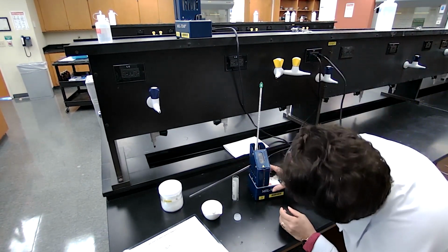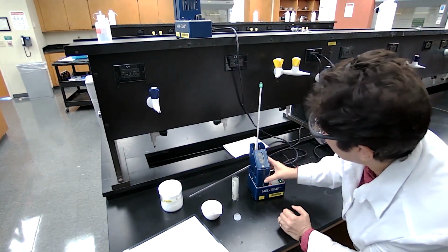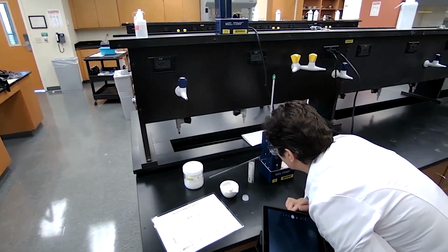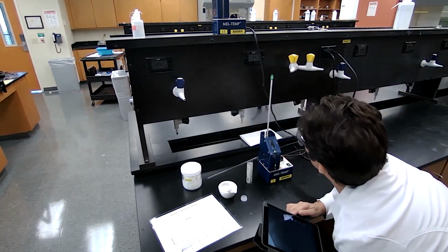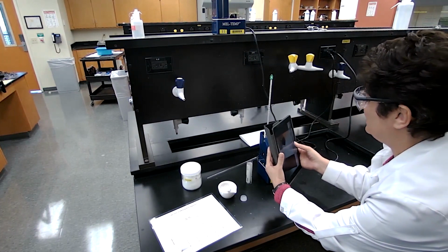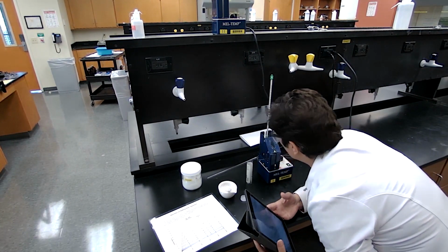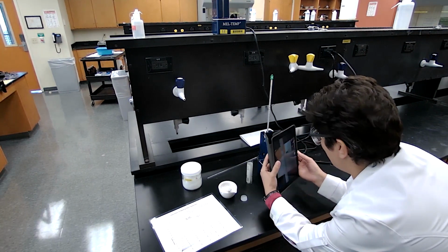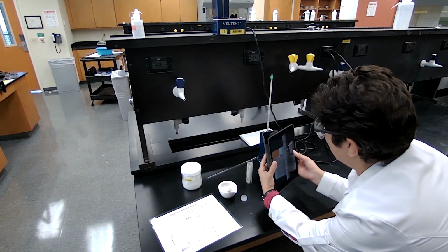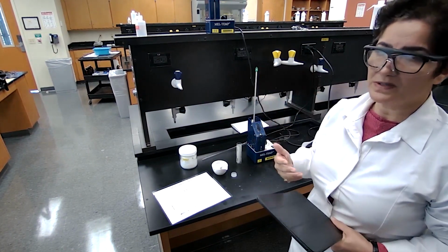It's melting rather quickly, so I'm just going to monitor it, starting to melt at around 46. I'm going to take a picture. At 47 it's already melted, so the melting range is 46 to 47. I just want to remind you that for this experiment, the students are using only one of the unknowns, and the professor is going to assign which one.